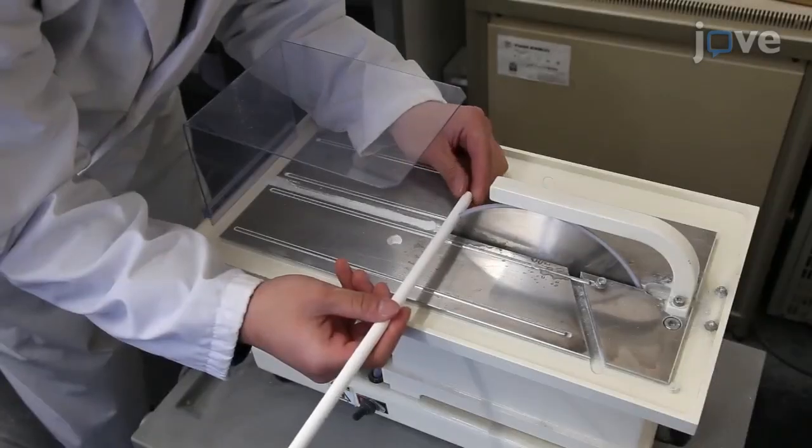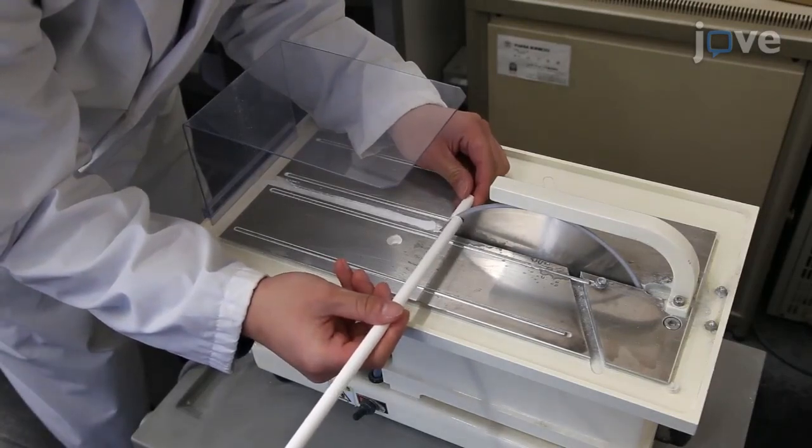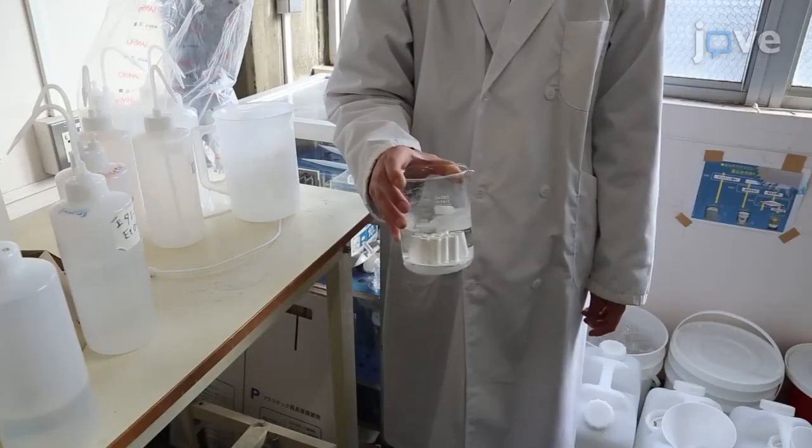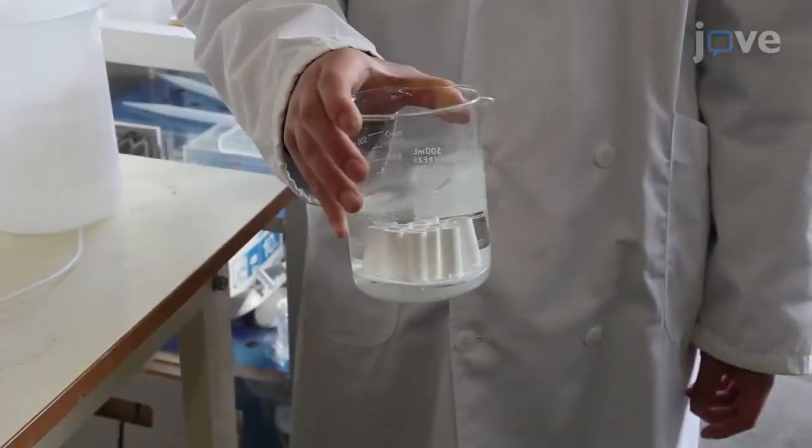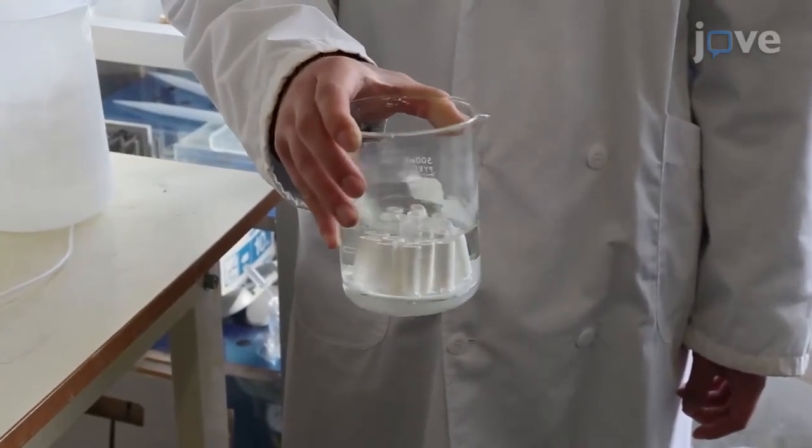To begin, cut out a 3 cm long tubular porous alpha aluminum oxide support. Wash the support with distilled water for 10 minutes. After that, wash the support with acetone for 10 minutes. Repeat this washing process twice.